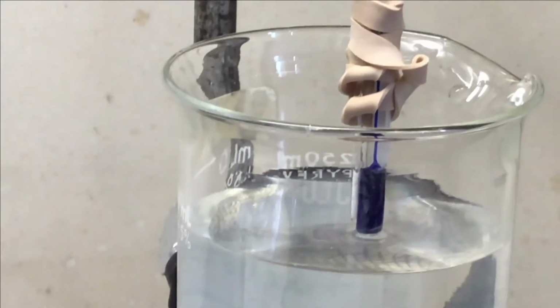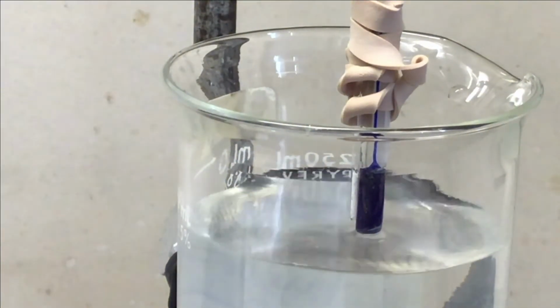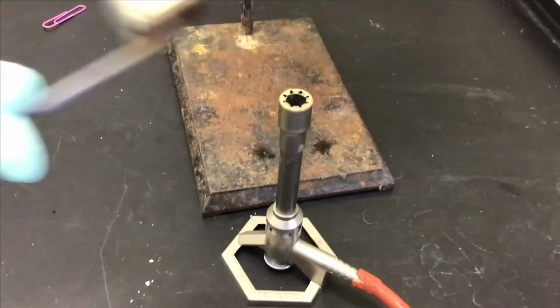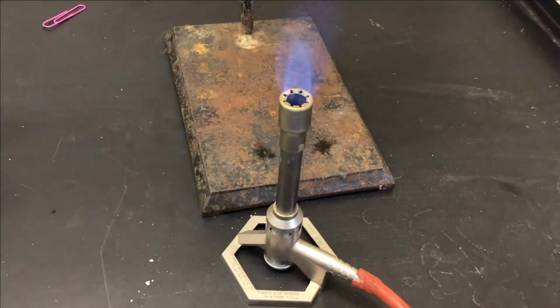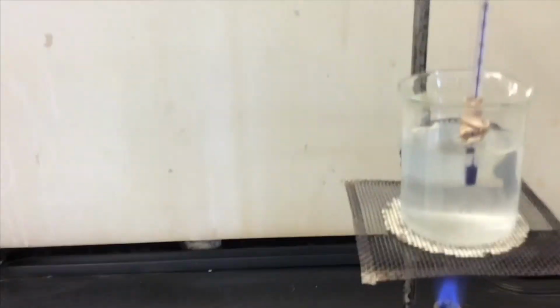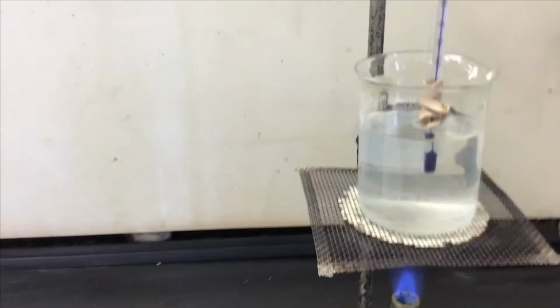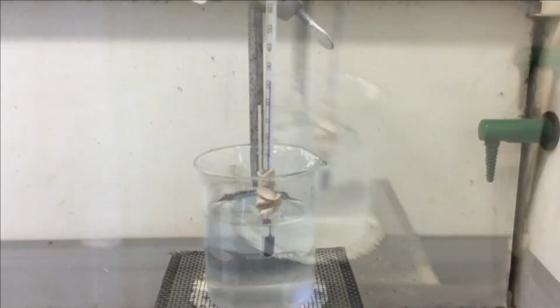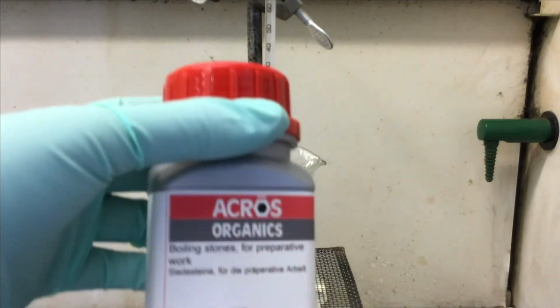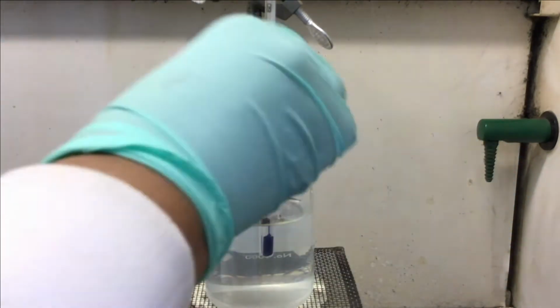We take our capillary tube and using a rubber band, attach it to a thermometer. We lower the thermometer and capillary tube into a 250 milliliter beaker filled with water. Then we light our Bunsen burner so we can heat our water and measure our melting point. We slowly monitor our capillary tube until we see our solid begin to melt. We finish our recording when the solid has completely melted. To aid in the boiling of the water, we're going to add 3 boiling stones to our beaker.